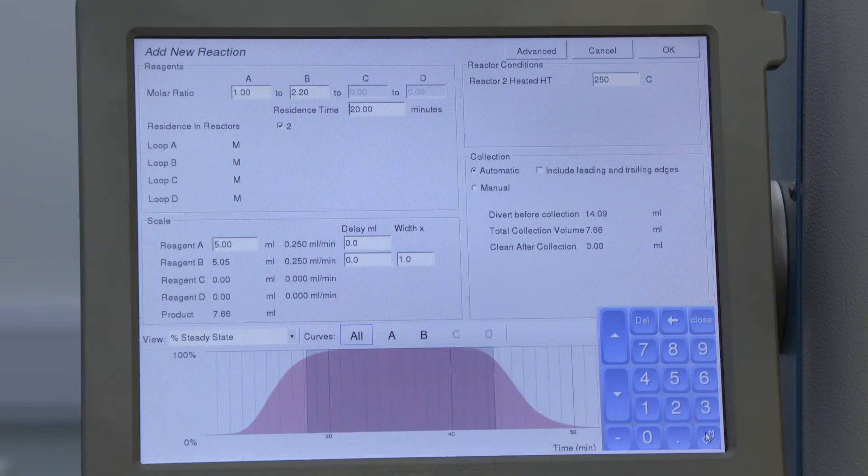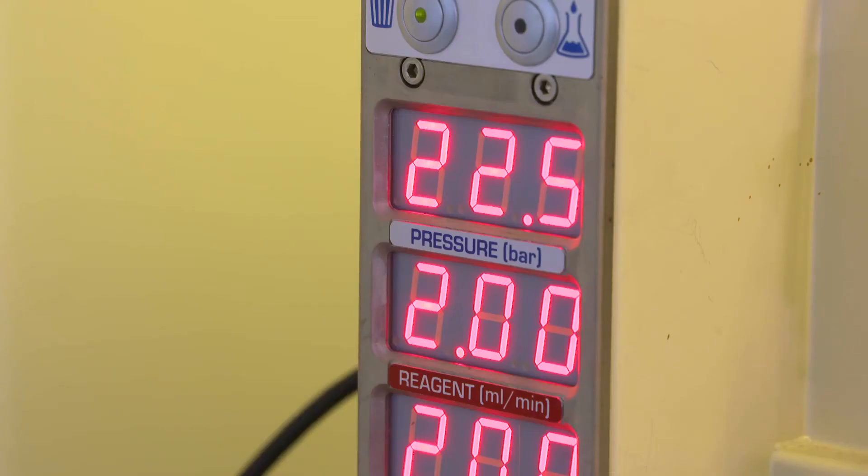And finally I can decide how my product is collected. Now that the reactor's at pressure, I can start the experiment without risk of the solvent boiling.